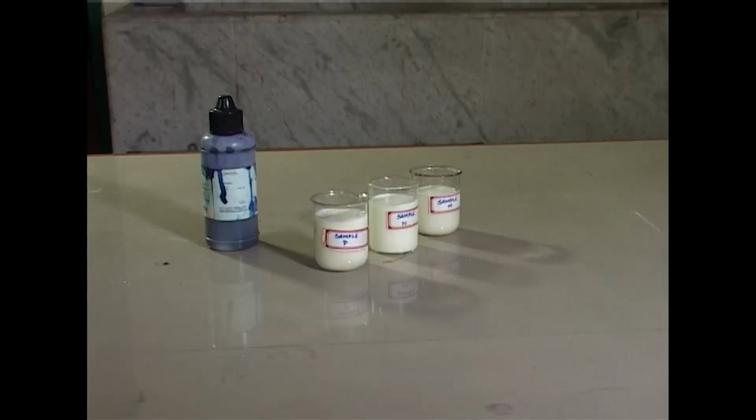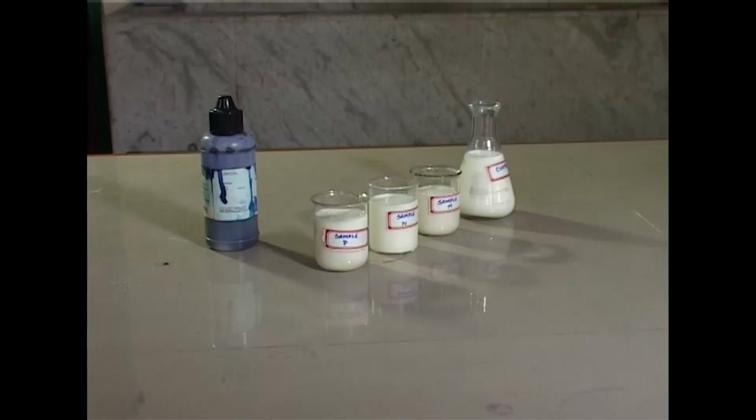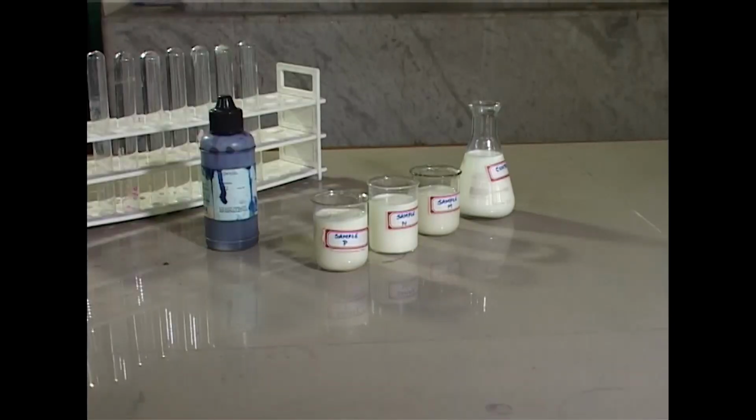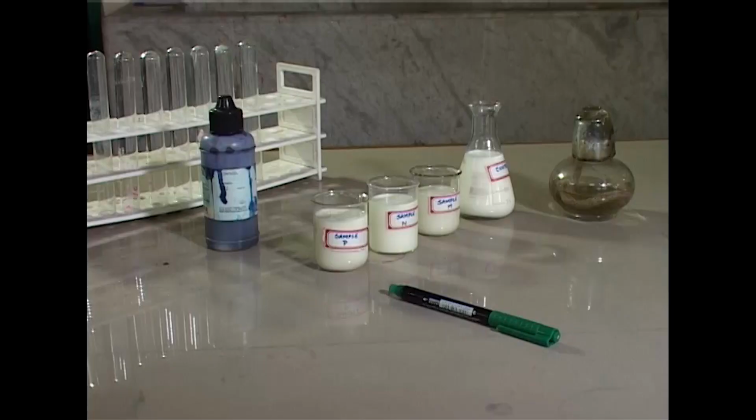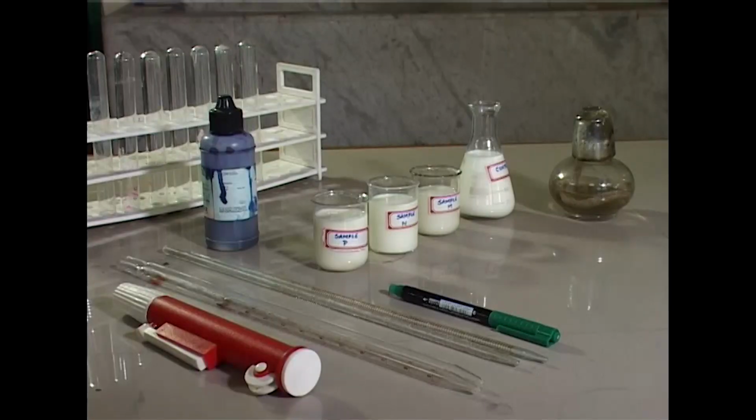We know that we have to keep a control for every experiment. So in this experiment, we are taking boiled milk as a control. Apart from this, we require sterile test tubes, a test tube rack, a glass marking pen, a spirit lamp, 10 ml glass pipettes, a 1 ml pipette, and a mechanical pipetting device.